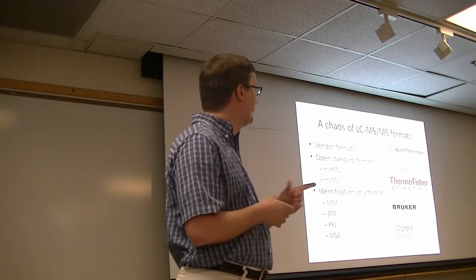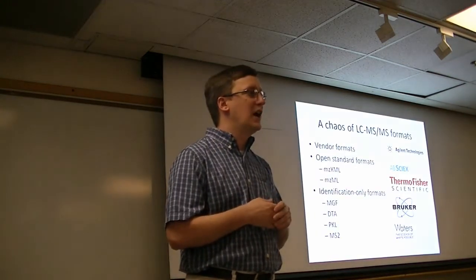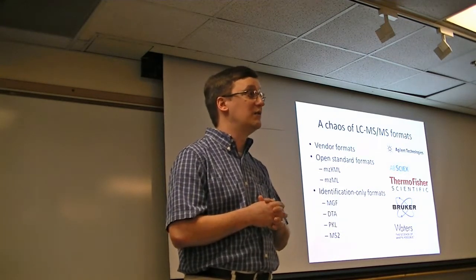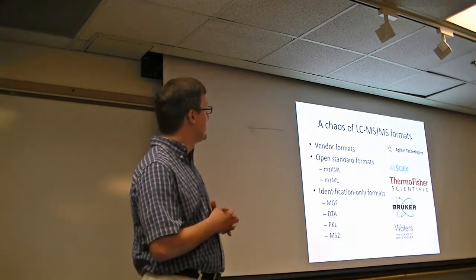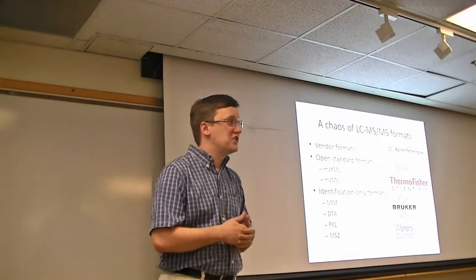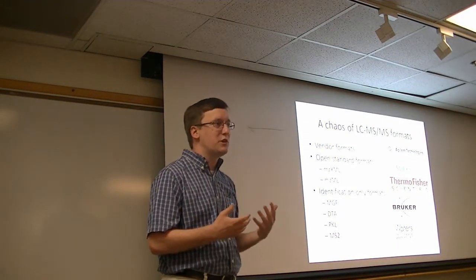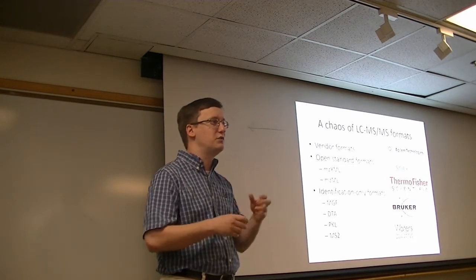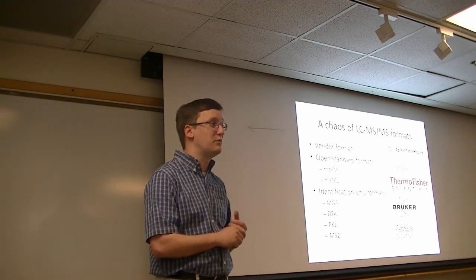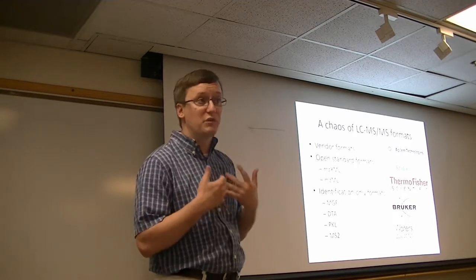So we tend to think of these 5 manufacturers at the right as being kind of the major mass spectrometry vendors, but I appreciate that could be a very different list than you would see for someone working in metabolomics instead. So we didn't list JEOL, for example, here, or Shimadzu, although we do have some limited support for Shimadzu. But for us, these 5 are kind of the major instruments that we're dealing with all the time within proteomics, and being able to start from any of those file formats and translate to other file formats was really hugely important for us.